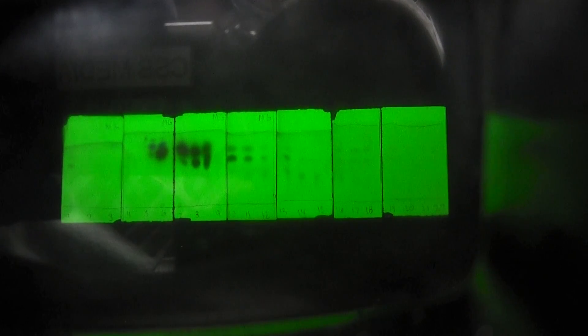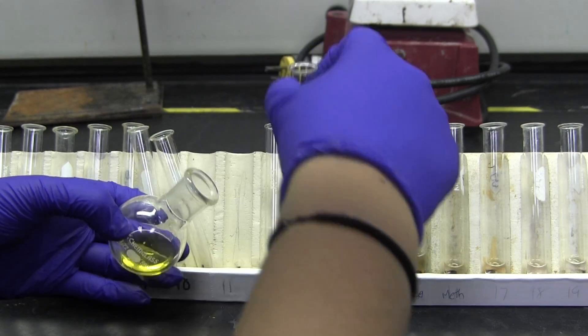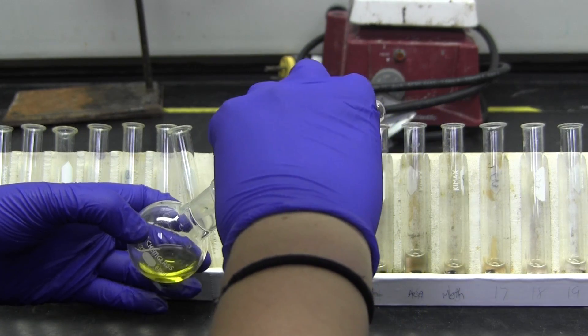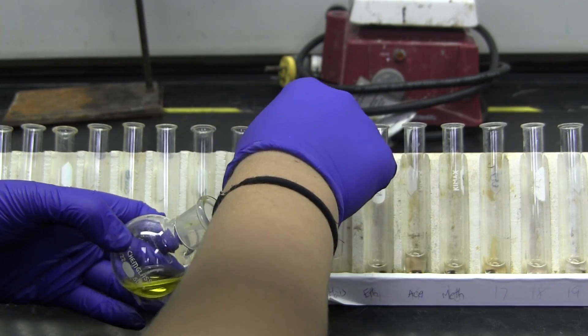Once unknown stops coming off the column, combine like fractions, meaning in separate containers, put all the fractions with the top spot together and all the fractions with the bottom spot together. Do not include the fractions that have both unknowns in it.